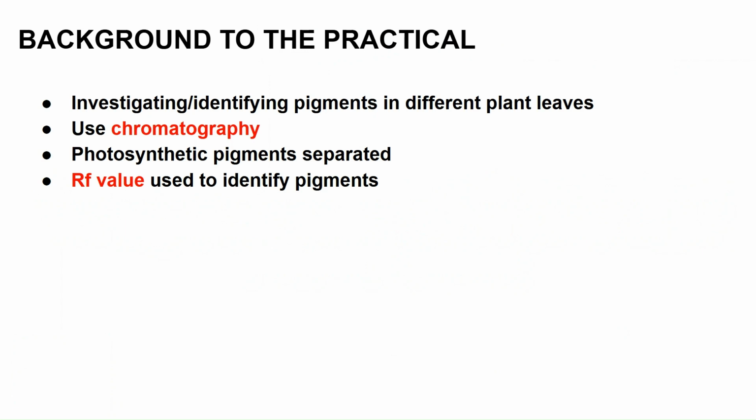In chromatography, I will take you through the method in a bit, but the photosynthetic pigments are separated, and then you use something called an RF value to identify the pigments, which I will explain later on in the video.